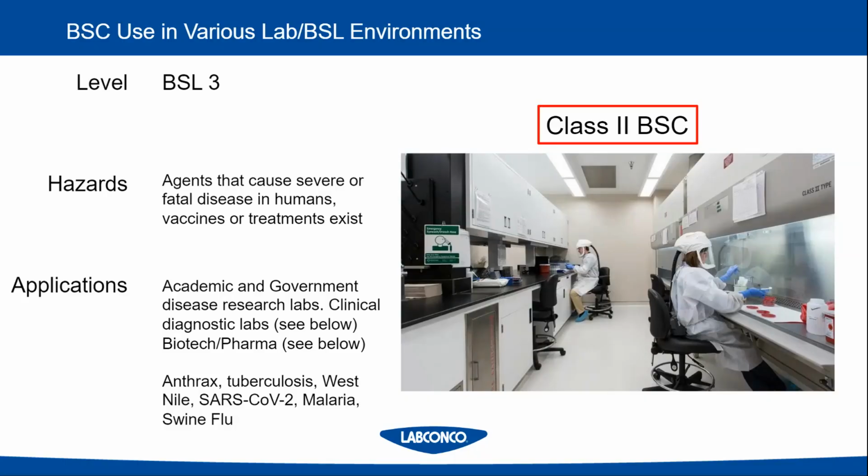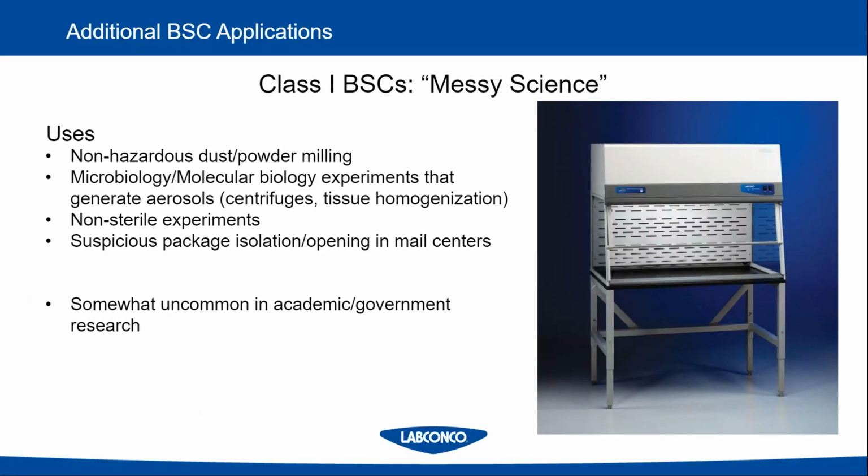There are a few other interesting applications. At the beginning, I touched on a class 1 biosafety cabinet. This is what I like to call messy science. This is things like grinding or powder milling of non-hazardous items, maybe microbiology or molecular biology experiments that generate aerosols.